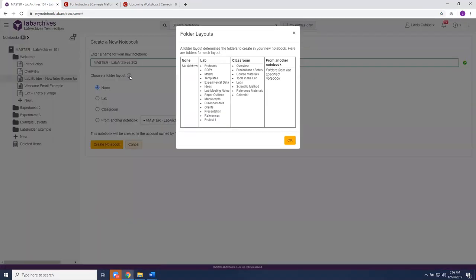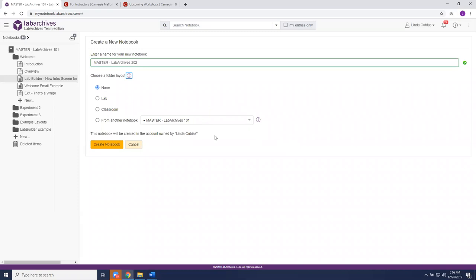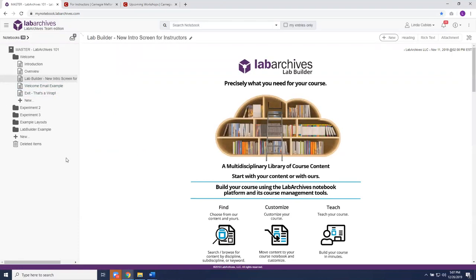Optionally, you can choose a layout: none, lab, classroom, or from another notebook. If you choose one of our layouts, you can always edit or modify it. The classroom layout gives you folders already created in your account — the folders are empty and you still need to add content, but you can delete, rename, or modify them as needed. You can also base the layout on a previous notebook you've created. Simply click 'Create Notebook' and you'll automatically be within that notebook to start adding content. For our purposes today, we already have a notebook created, so we'll cancel out and go back to our current notebook structure.